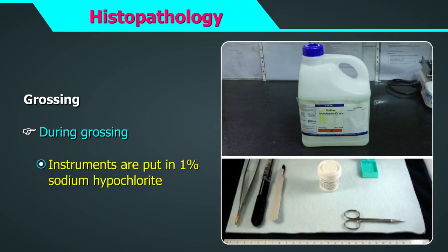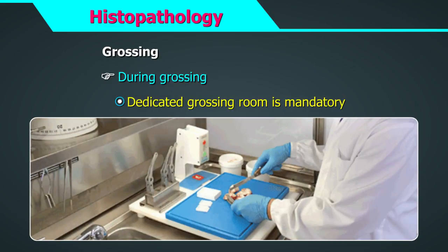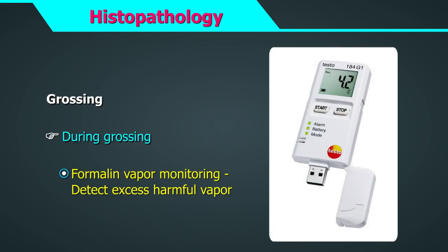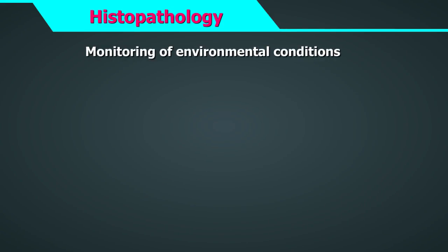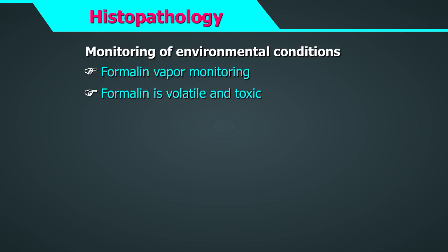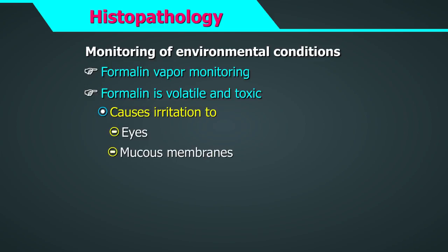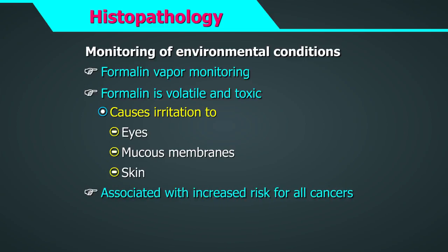Proper gloves, mask, and apron should be worn every day while grossing. Grossing stations should be cleaned with 1% sodium hypochlorite daily after grossing. Instruments used in grossing should be put in 1% sodium hypochlorite after use. A dedicated grossing room is mandatory. Formalin vapour monitoring must be done to detect excess harmful vapour. Apart from temperature and humidity, formalin vapour monitoring forms are an important record in a histopathology laboratory. Formalin is volatile and toxic and causes irritation to the eyes, mucous membranes, and skin, and is associated with increased risk for cancers.